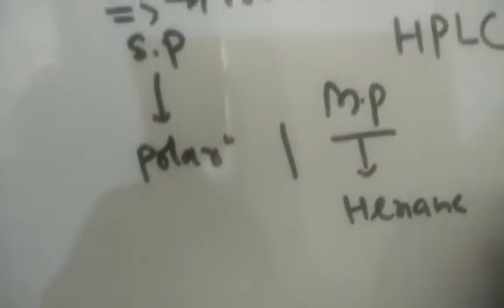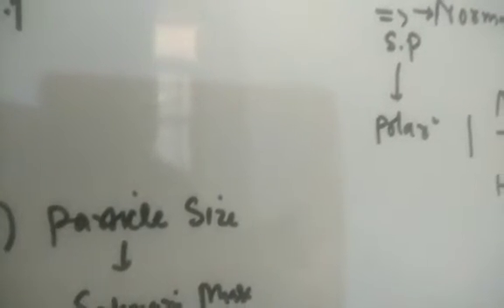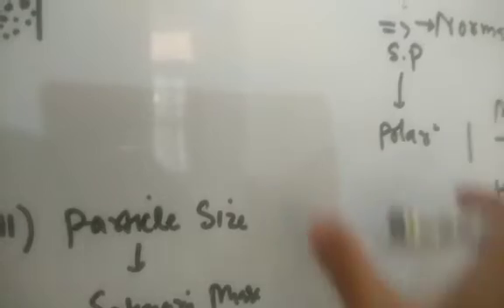So this is our stationary phase, that's polar usually, and the mobile phase is non-polar, let's say hexane. Usually it is hexane, suitable too. Now this type of chromatography, where we use the polar adsorbent, or we pack the column with the polar stationary phase like silica gel, and the solvent is hexane, which is non-polar, and then you have a column. Yes, usually in column chromatography.